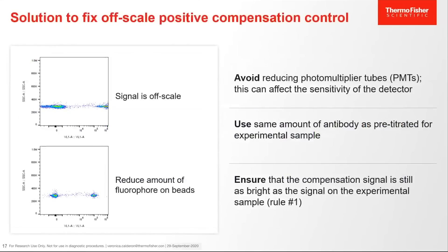If the compensation control is off-scale, there is a solution to fix this. First, try to avoid reducing your PMTs, as this can affect the sensitivity of the detector that was previously optimized. Some researchers will slightly adjust their voltages, usually for low-expressing markers, by using cells stained with the experimental antibody. But in general, detector settings should be kept consistent. The recommendation is to use the same amount of antibody as would be used on cells, predetermined by titrating your antibodies. Remember to ensure that Rule 1 still applies and the compensation signal is still as bright or brighter than the signal on your experimental sample.